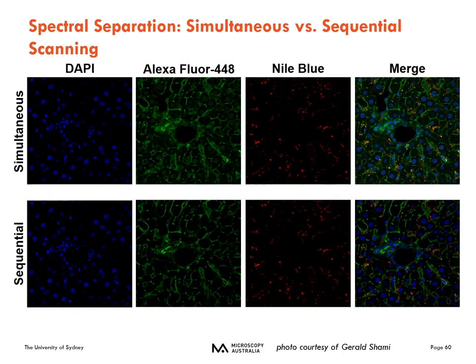Or you can use spectral separation via sequential scanning to separate fluorophores which are close together, to avoid crosstalk.